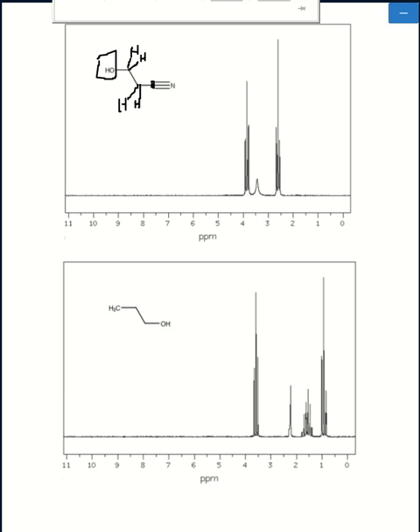And well, it looks like you have one peak here, one peak here, and a little peak down here. And I'll just let you know right off the bat, I'm assuming that NMR is new to you guys, and I will go off of the assumption that you may not have been taught this stuff yet in the lecture component. Well, an alcohol hydrogen likes to show up as a tiny broad peak as opposed to very fine straight peaks.